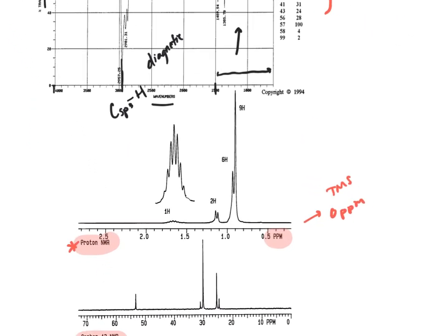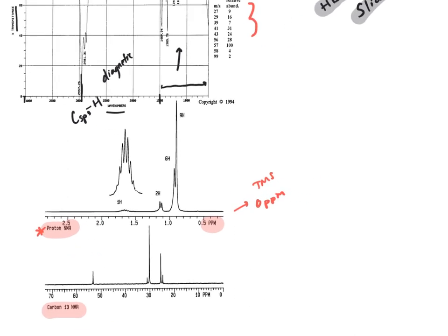Okay, so then we'll move down to the Proton NMR. And Proton NMR is, especially for this guy, going to be the most important thing that's going to help us produce the structure for this compound given the molecular formula, okay? Now, there's a bunch of stuff that we can take away from the Proton NMR, right? First thing is going to be the number of signals, right? So what is the number of signals telling us? It's telling us the number of chemically non-equivalent protons, of unique protons in the overall compound.